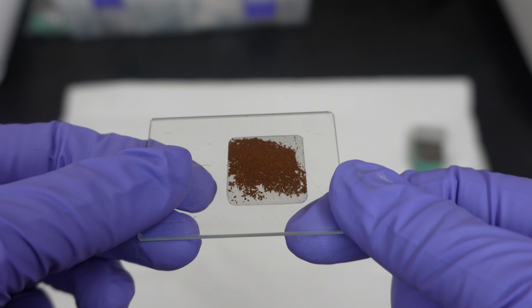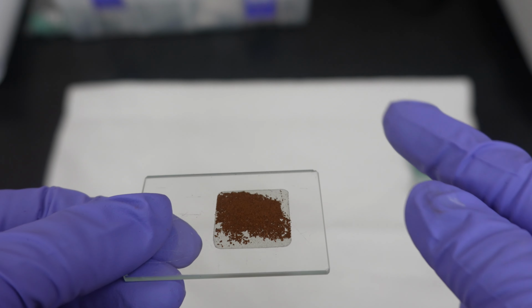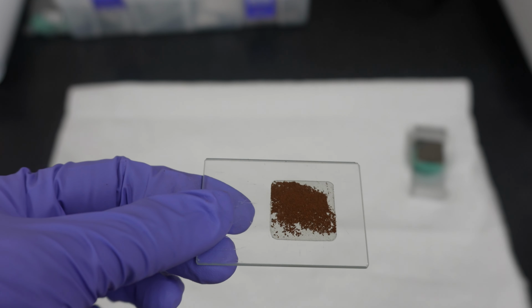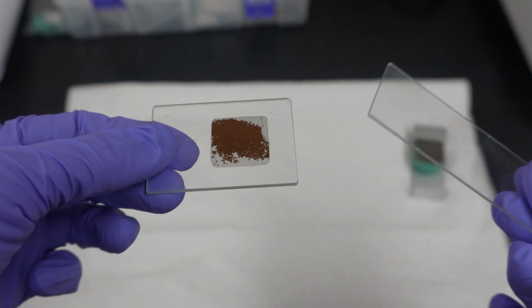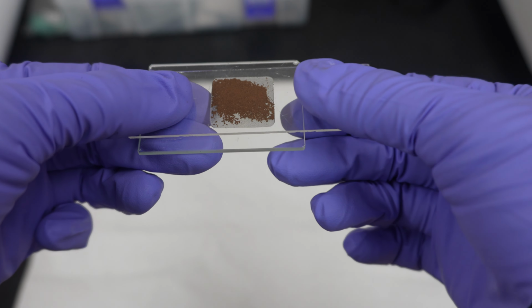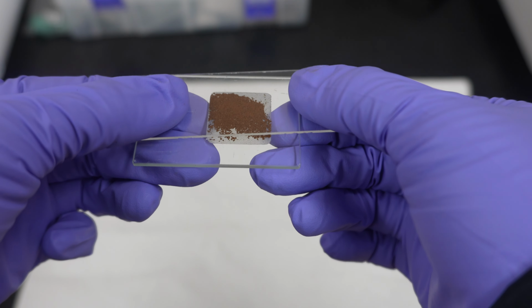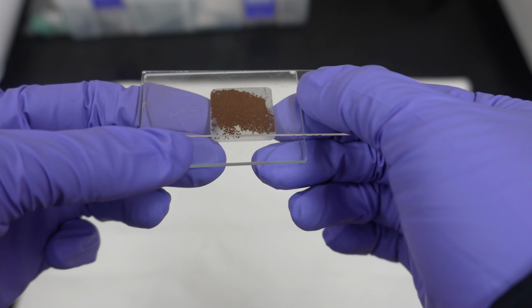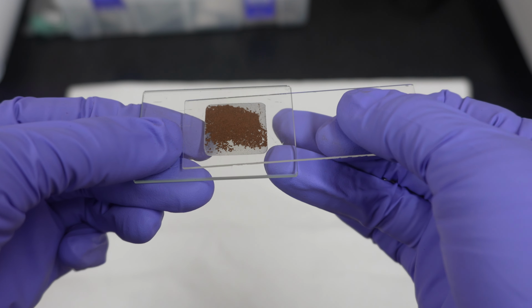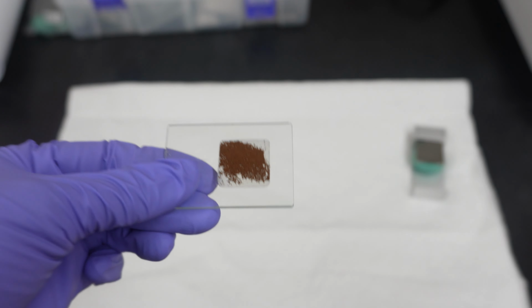For this analysis, actually you don't need to fill it completely, only a small amount is enough. But the key is how to make it compact so it doesn't ruin the inside of the chamber. Then we need to press the sample using the glass we used before, and then do pressing like this. Sometimes we also need to press it or tap like that, to make sure that it doesn't go away.